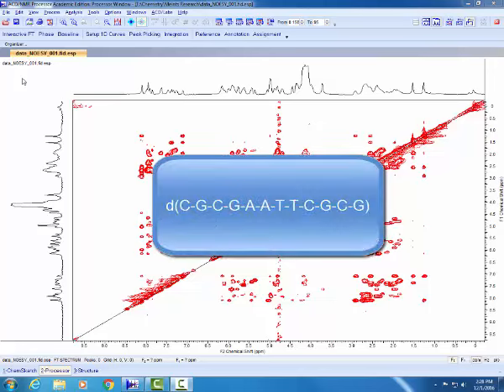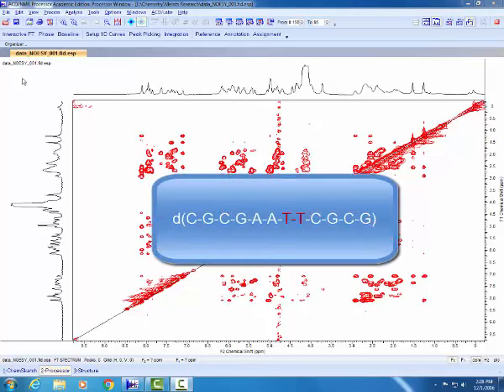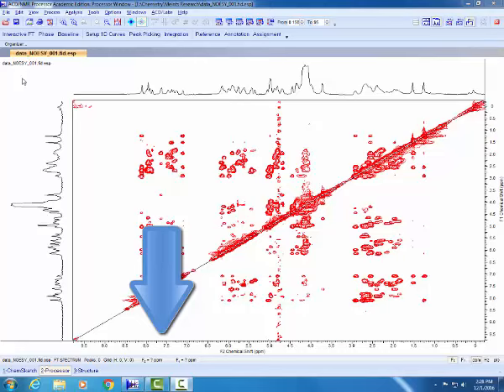Since we already know the sequence, this video mostly serves to acquaint yourself with the process of peak identification and the NOESY walk. The first step in any identification is unique features, so that is where we will begin as well. We know from our nucleotide structures that thymine is the only base to have a methyl group, so that is one important identification tool, as the only thymine bases in the Dickerson dodecamer are the T7H6 and T8H6 bases. Methyl peaks have a chemical shift around 1 ppm, and we are looking for where those peaks indicate an interaction with the nucleotide bases, which is around 7 ppm in the aromatic region.